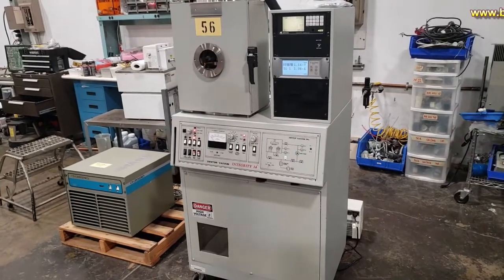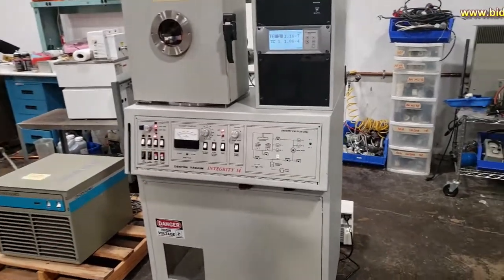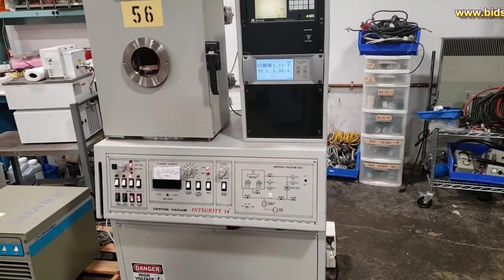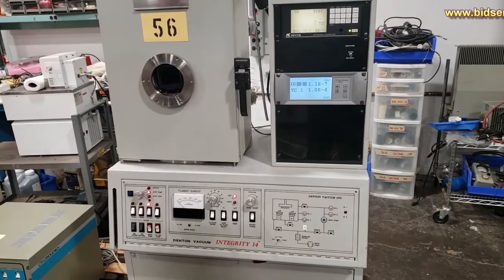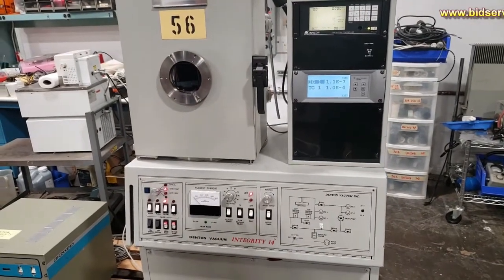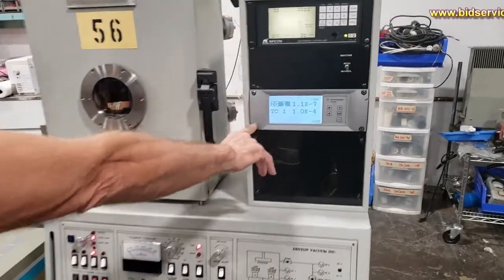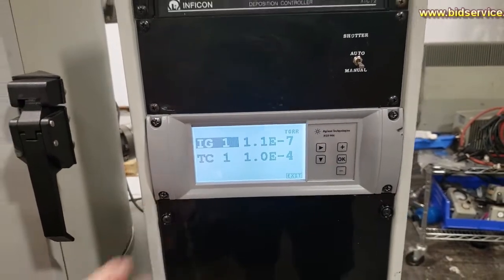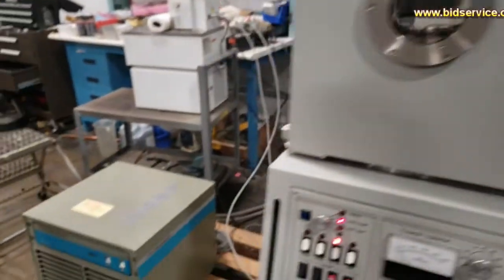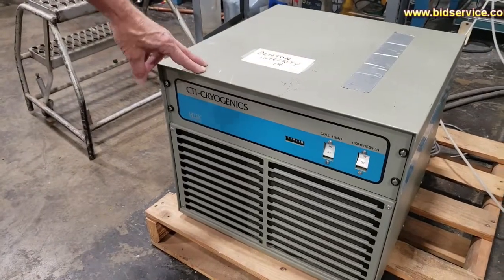This is a video demonstration of the Denton Vacuum, Integrity 14. It's a two-source thermal evaporation system. The first thing to discuss is the gauge controller for your vacuum system. This is a cryo system using an air-cooled CTI-Cryogenics compressor.